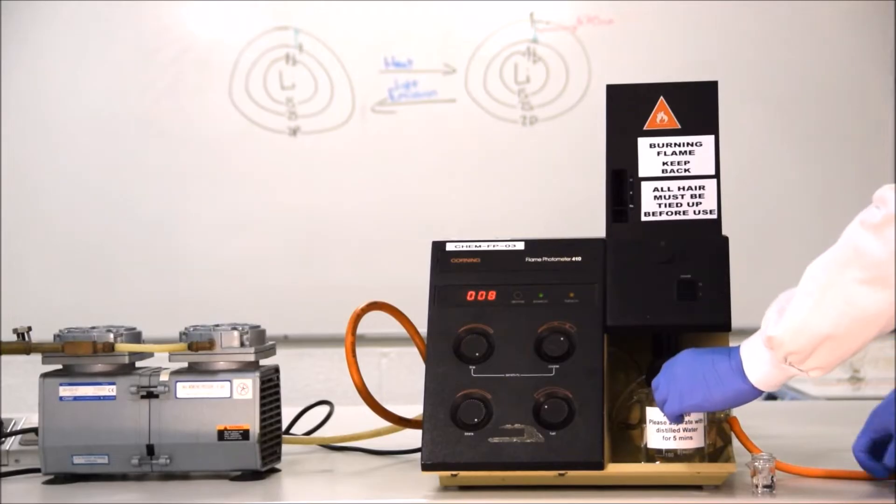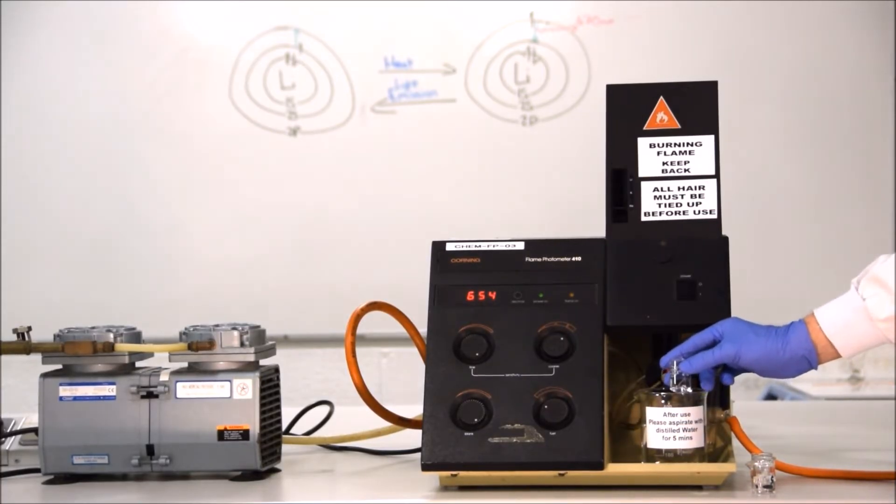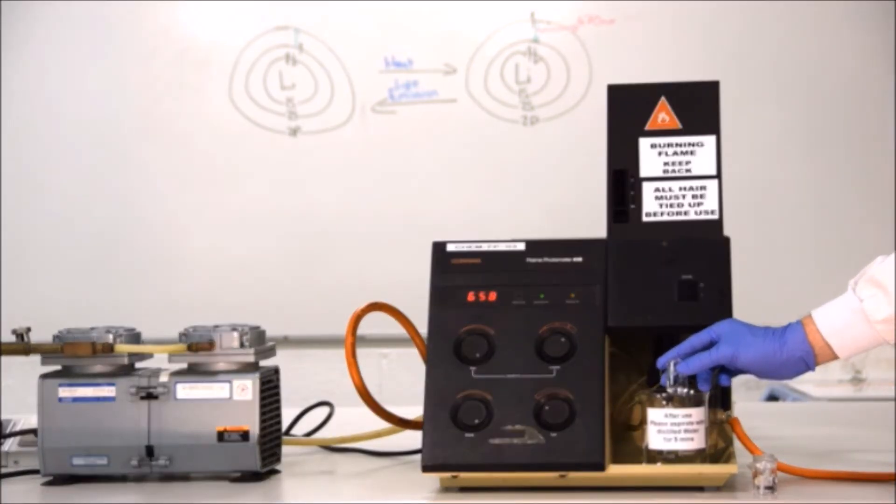If this is not the case, then we can adjust the sensitivity using both the coarse adjustment and the fine adjustment wheel. You will then have to re-zero the machine once you've picked a suitable sensitivity. You will have to change the sensitivity settings between each different metal that you measure.